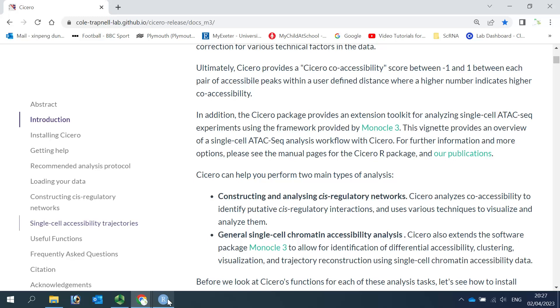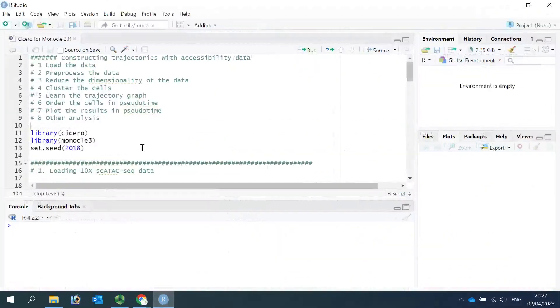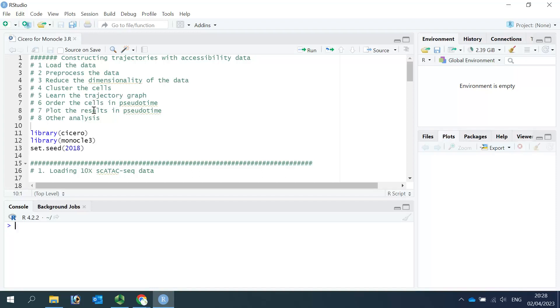For today's analysis, we can divide into eight steps. The first step is to load the data, then data preprocessing. The third step is to reduce the dimensionality using UMAP. After that, we can cluster the cells. For trajectory analysis, we use the learnGraph function, then order the cells, then we can plot the UMAP. After that, we can perform other analysis.